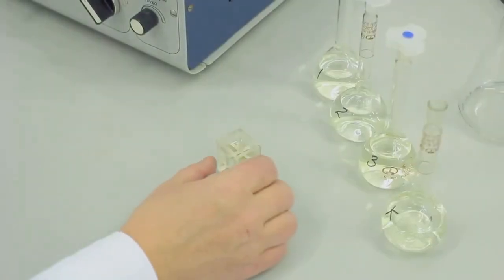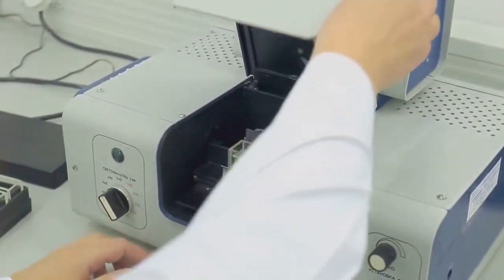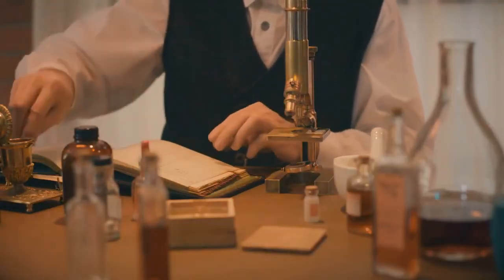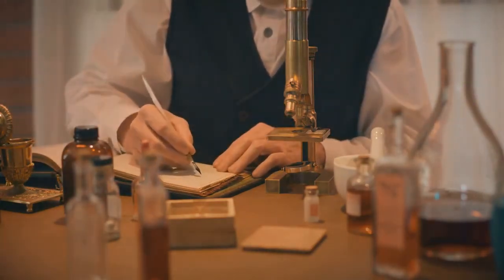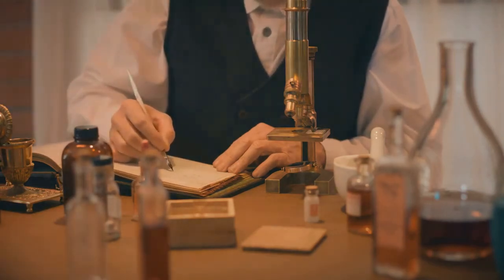We started our journey by understanding the importance of the spectrophotometer in scientific research. It's not just a fancy piece of equipment sitting on a lab bench, but a critical tool that enables scientists to measure and analyze the properties of light over a specific portion of the electromagnetic spectrum. Thanks to this device, researchers can understand the interaction between matter and radiated energy, a fundamental aspect of scientific studies that span across numerous fields, from biology and physics to chemistry and environmental science.